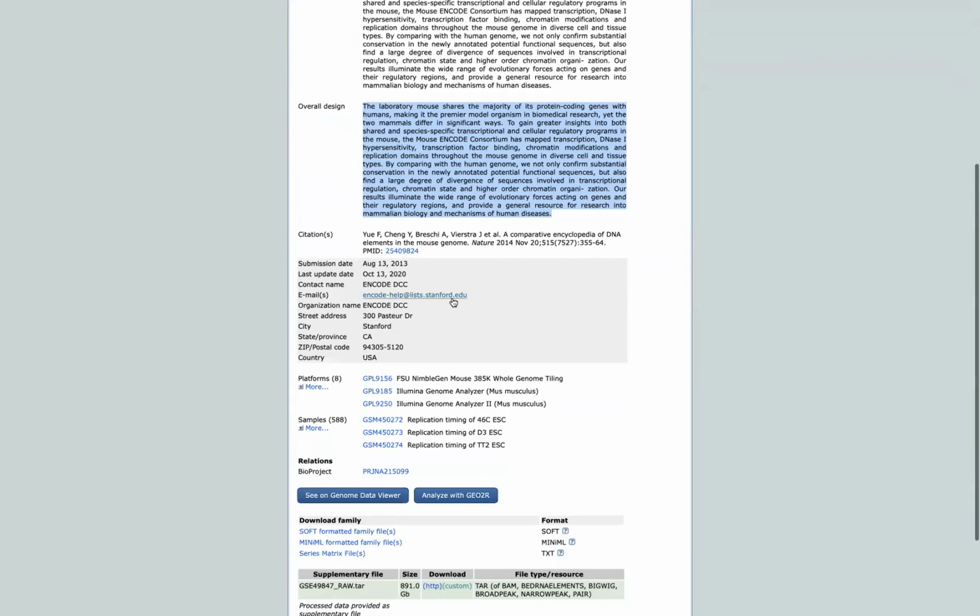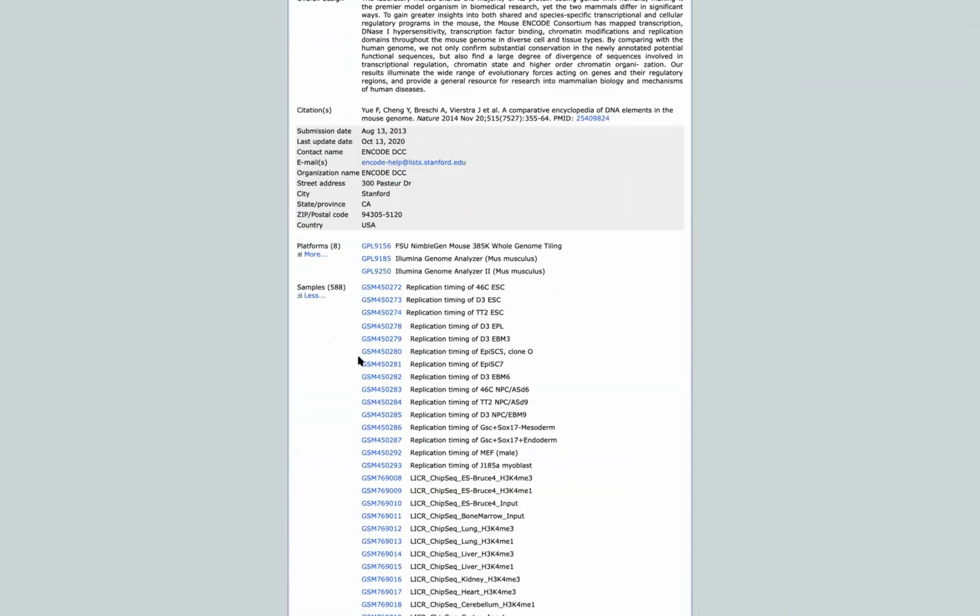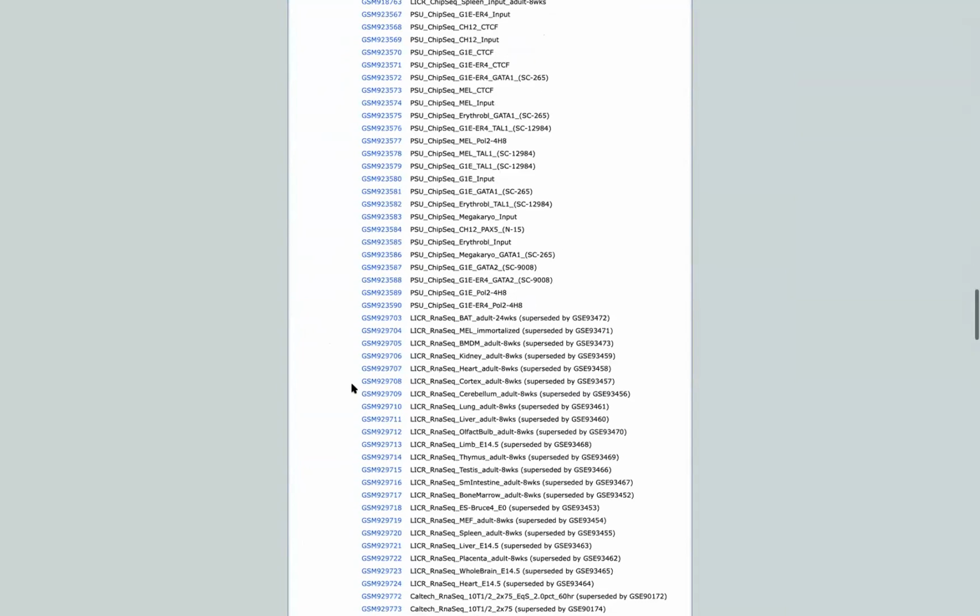There's always got to be someone who can be contacted by GEO. So if you ever have a problem with someone else's entry, you have a contact, usually either the PI, so usually the last author, and quite often you'll have a paper associated to it too. Often GEOs are filled up before you've published your paper, sorry. So quite often the publication isn't actually right. It's not the right place for it, but in this case it does match.